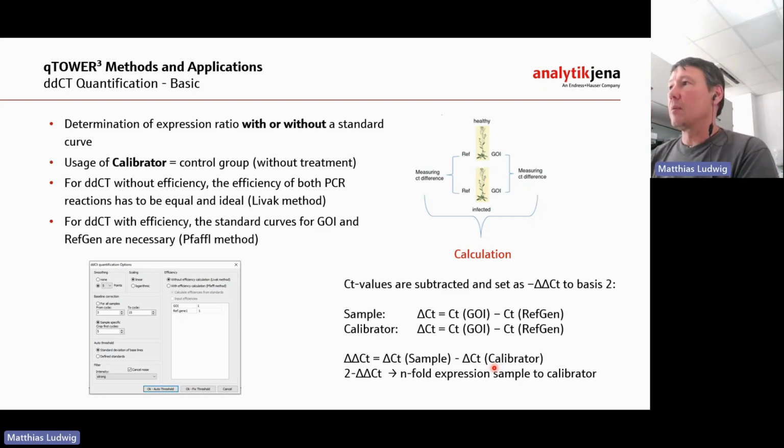It is used to detect whether a gene is switched on or off, or how the organism reacts to different environmental changes.